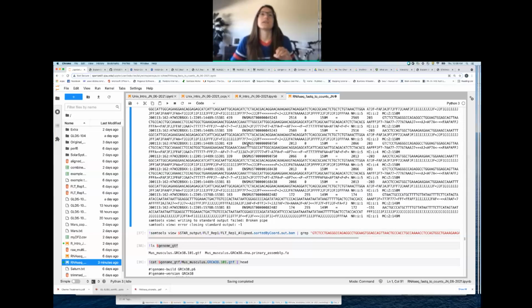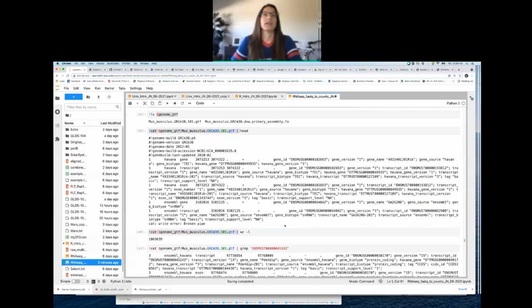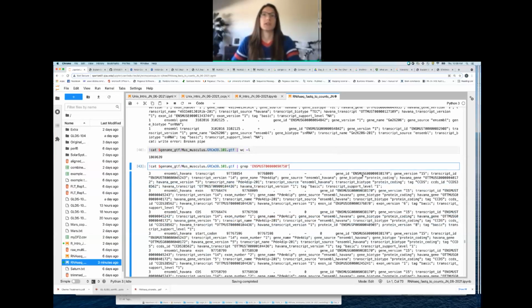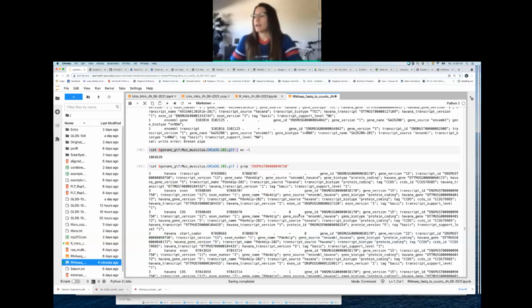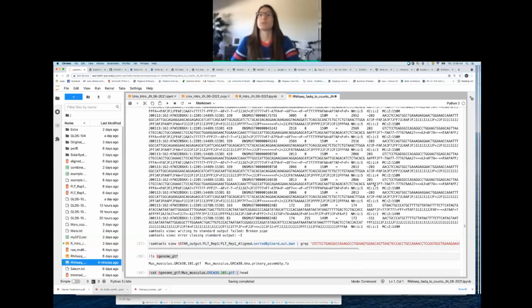This is the next one. And you see I'm just going down the line for each one of those 5 transcript IDs, pulling them out of the GTF file with this grep function and looking for what gene that transcript originated from. Playing this again, we see that's the 4th transcript coming from that same gene ID ending in 38170. And then let's check that 5th one, just for completeness sake.